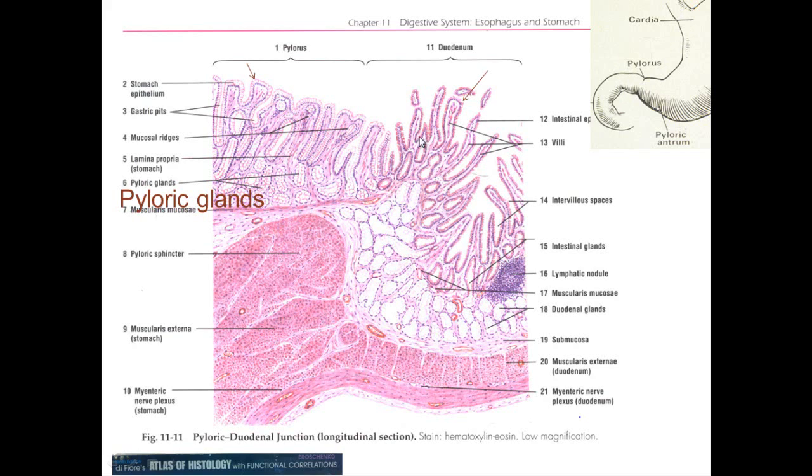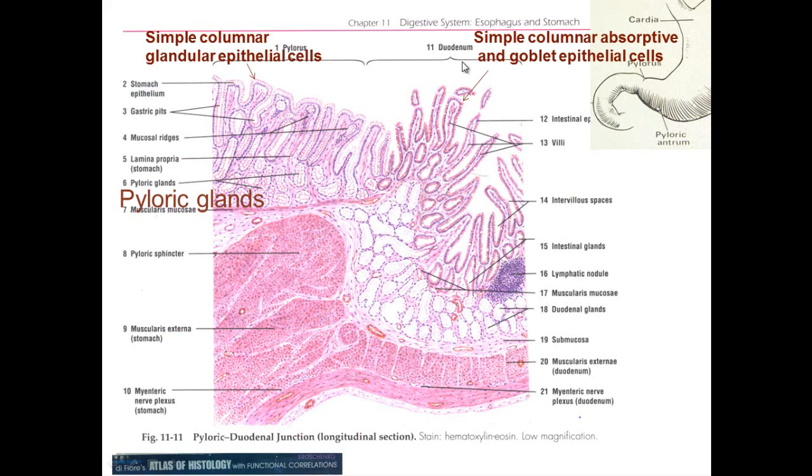small intestine, and that's what we see here is the small intestine. And in this so here's the stomach. We have a simple columnar epithelium of the different types of cells we just mentioned. And here in the intestine, we have simple columnar absorptive cells and goblet cells and argentaffin cells. Of course, you have argentaffin cells in both of these.